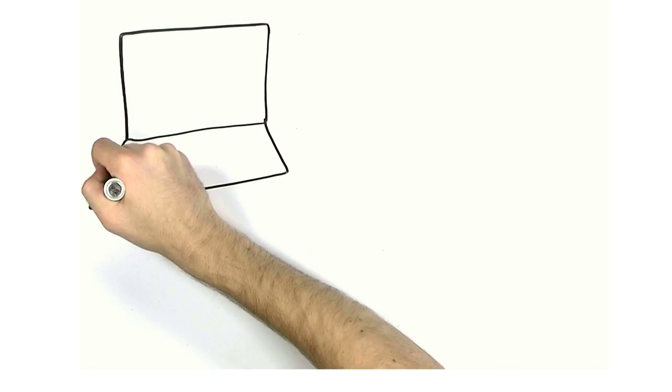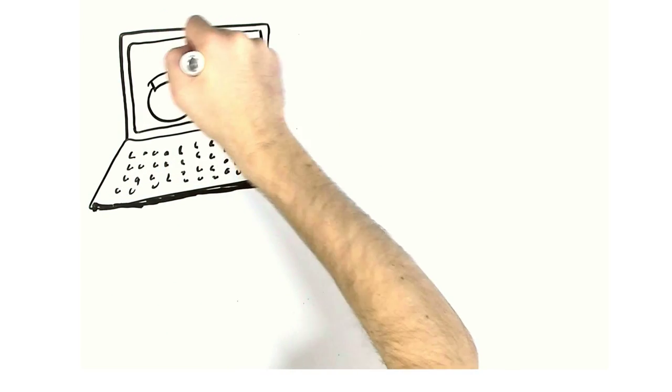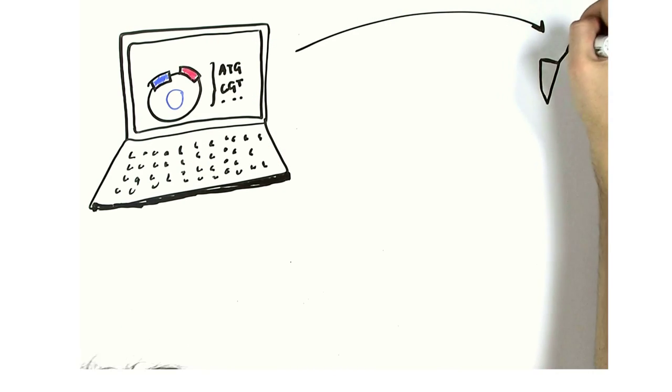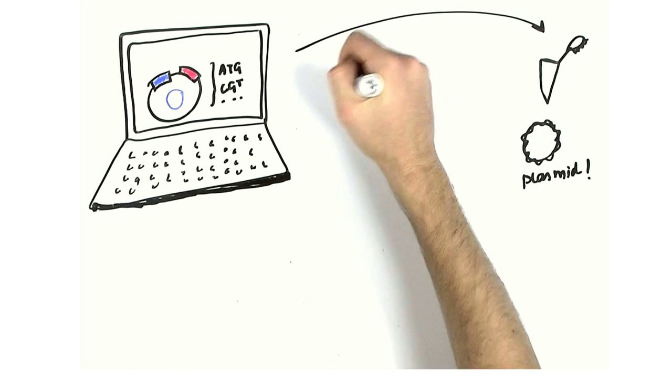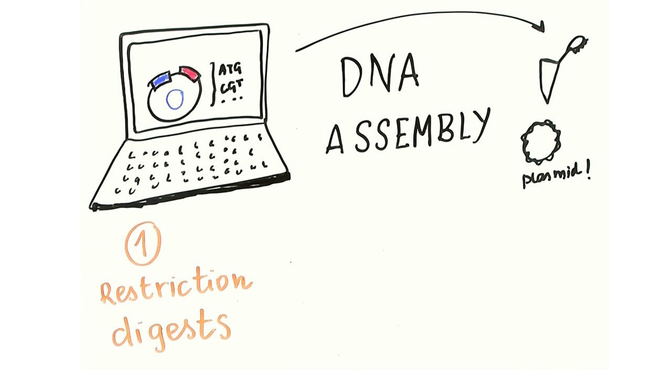After you have designed your plasmid with the appropriate parts, origin of replication, and antibiotic marker, it's time to take what you have designed on the computer to an actual molecule that you can transform. This DNA assembly can be done by repeating the following four techniques.